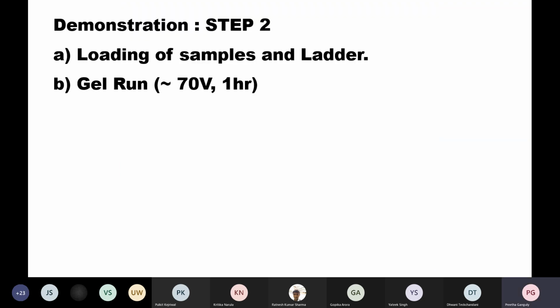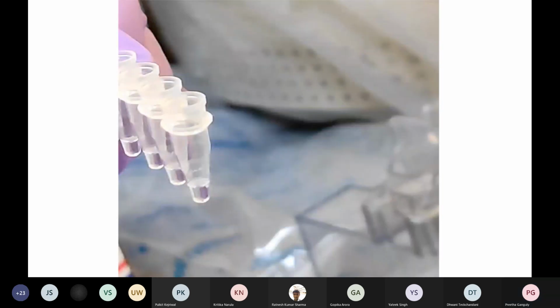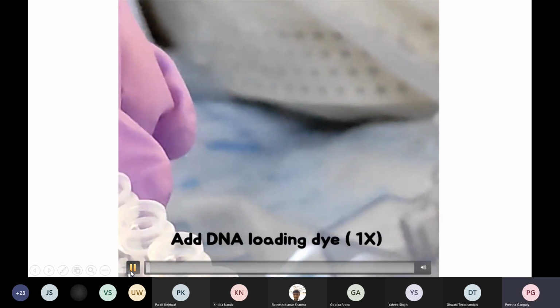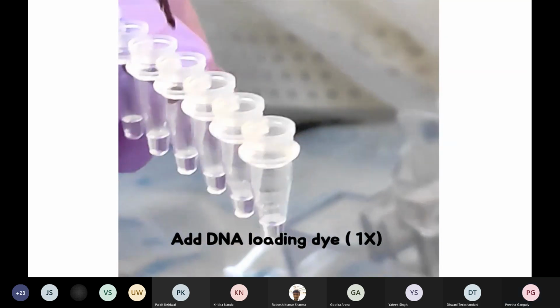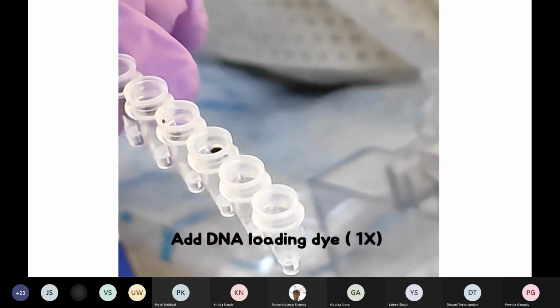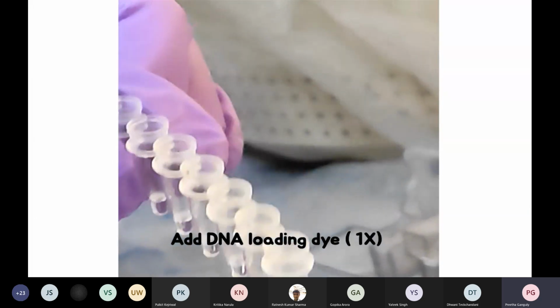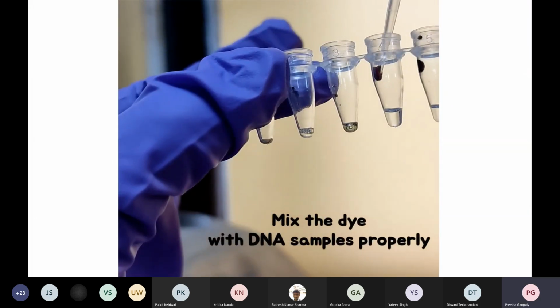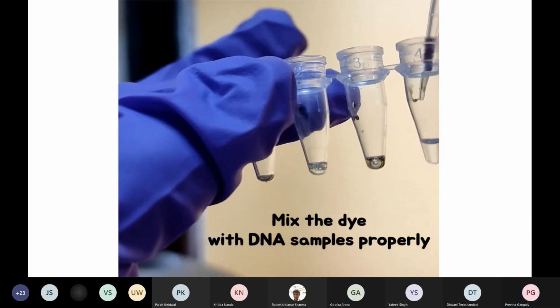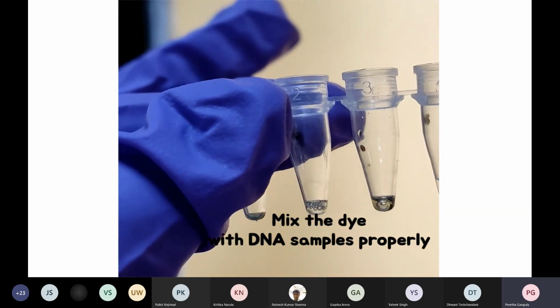Now in the next step we will see how the loading of samples and ladder will take place, and then we will run the entire system at 70 volts for 1 hour. These are the samples of DNA which need to be loaded. Now we will add the loading dye, which can be bromophenol blue or orange G, and we will mix it properly with the DNA.